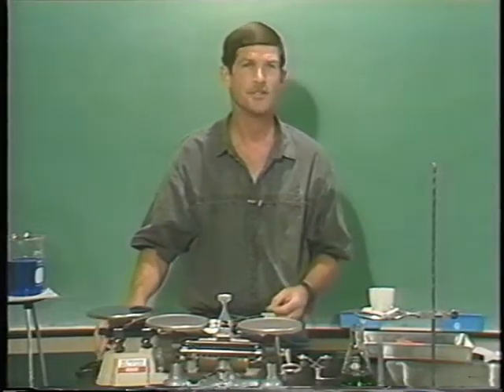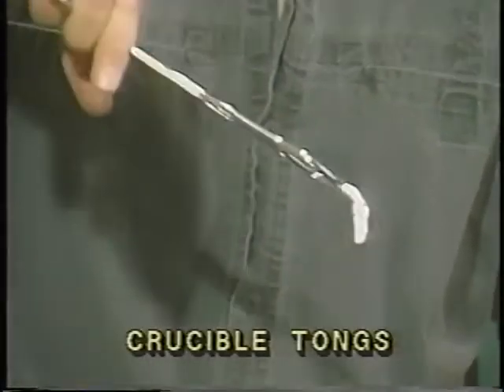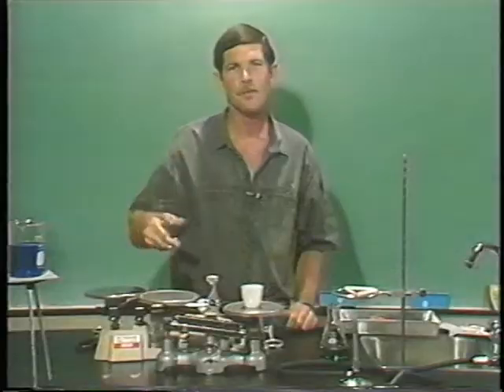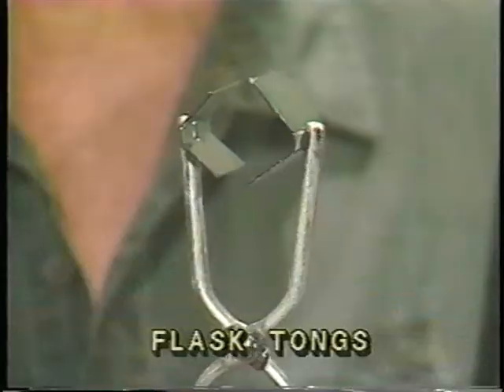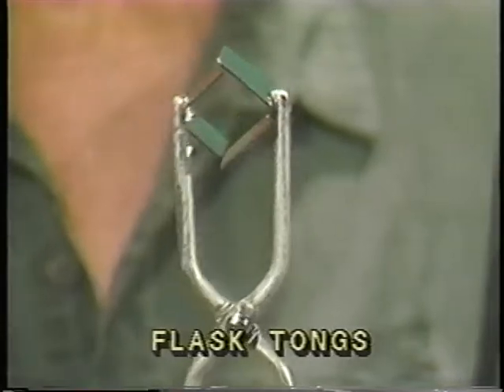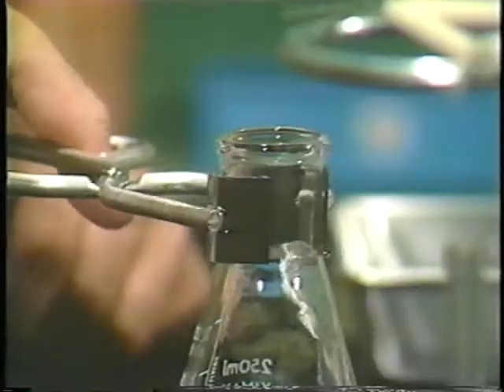We also have another type of tongs called crucible tongs. These can be used to fish things out of acid or something like that, but also pick up crucibles. Then we have another type of tong called a flask tong. These are strange looking guys. Take a look at that. These are used in picking up flasks.